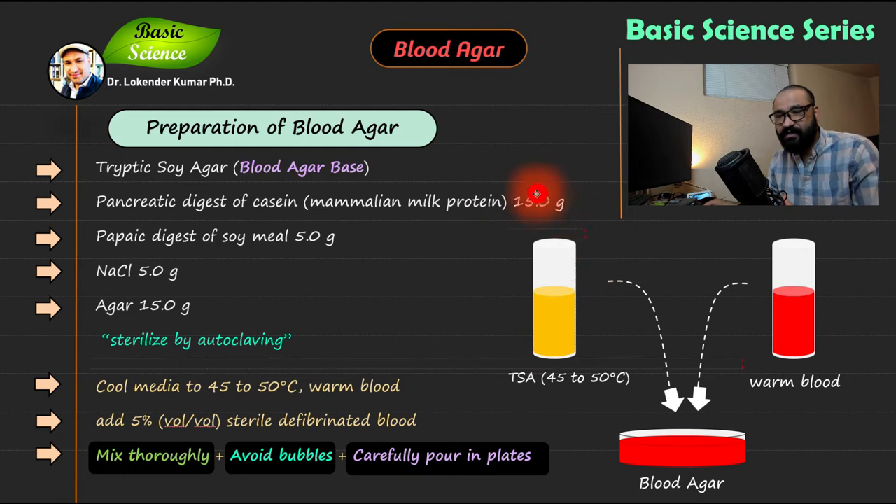You need to sterilize this blood agar base by autoclaving. After autoclaving you will have a sterile blood agar base or tryptic soya agar. We'll make separate videos on autoclaving, but the key point here is that you need to sterilize the media using autoclaving.